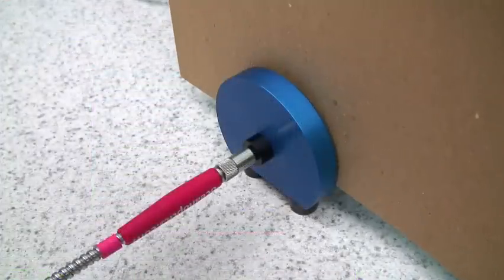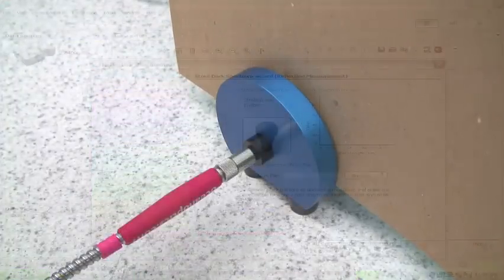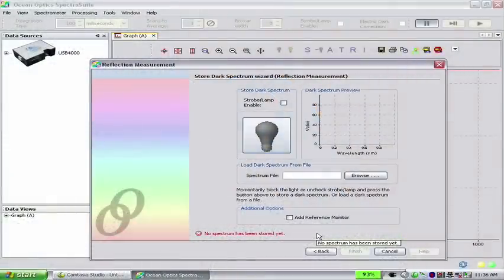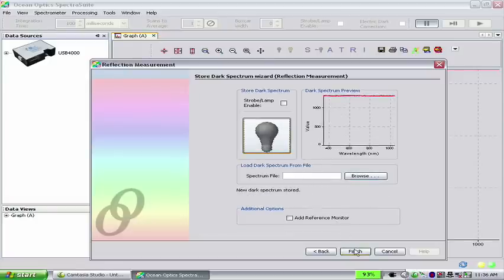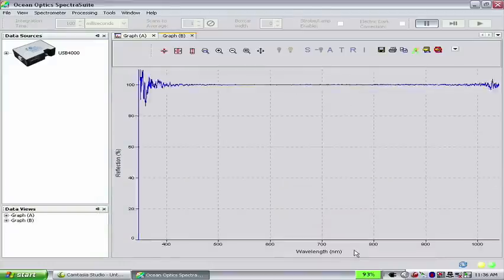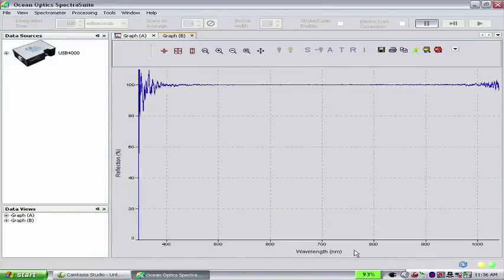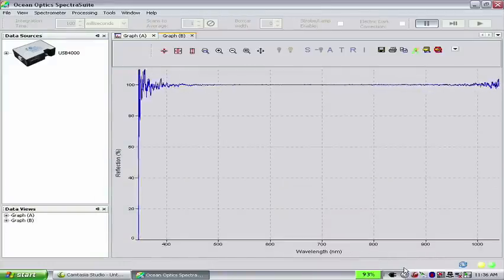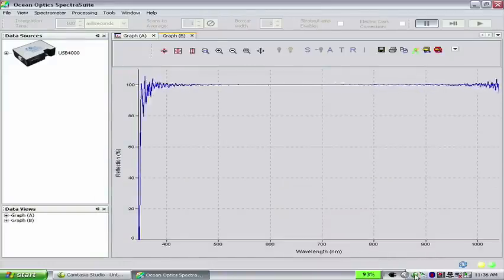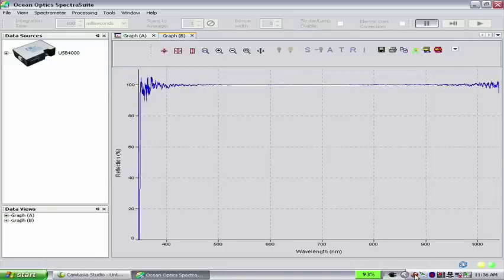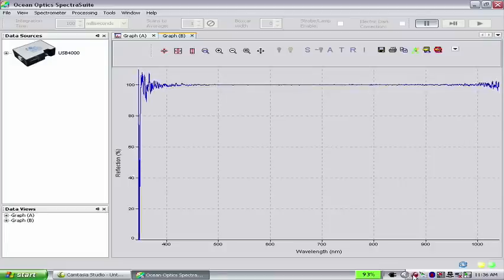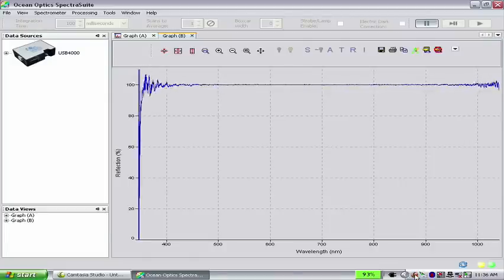Close the shutter on your light source to block the incident light and then click on the gray lightbulb button to store the dark spectrum. Now click Finish. You will now be back at the main SpectraSuite window. Here you'll see a flat spectrum at 100% reflection with noisy data at the extremes. This noisy data is due to the lack of signal from the light source in these regions.